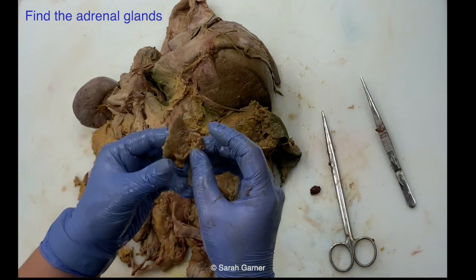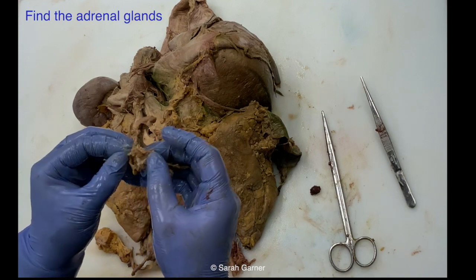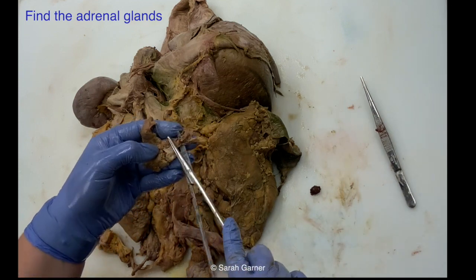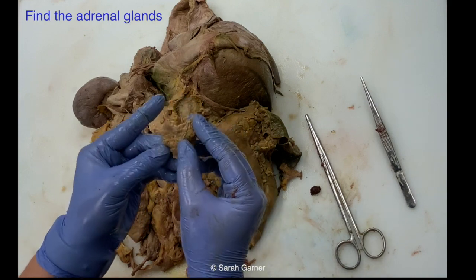These are pretty fragile, especially if the decedent passed away a couple days ago. So that's what the inside looks like. But ideally you want to get, it's just a vessel. Ideally you want as minimal fat left on there as possible, and then you can get a weight on this.